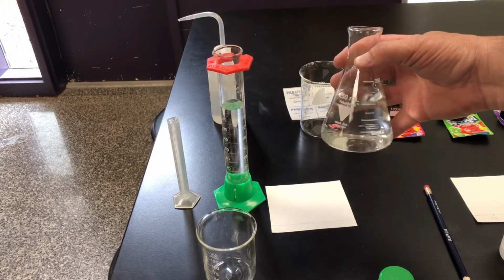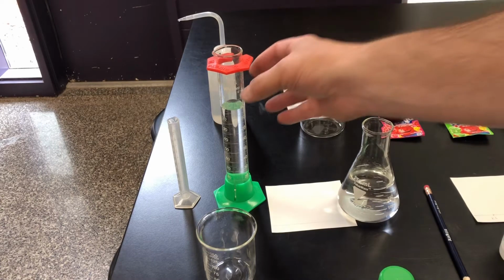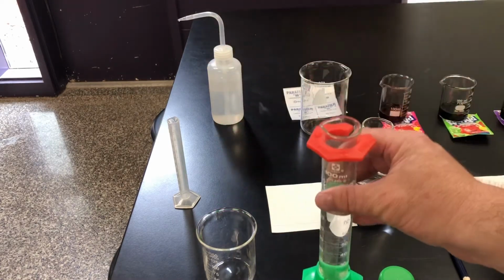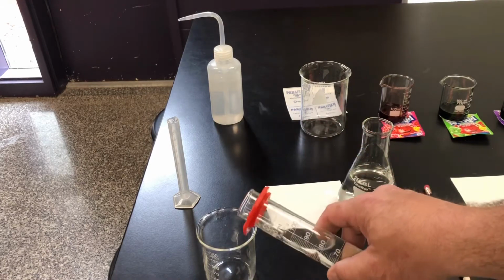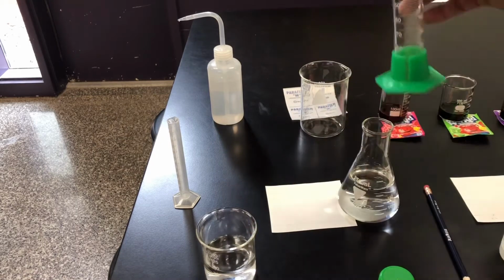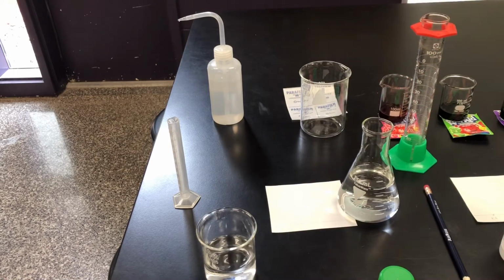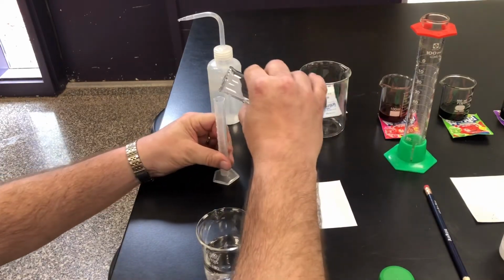So how do I get to 0.1%? It's kind of a serial dilution. For serial dilutions, we can take 90 milliliters of distilled water, and then what I would want to do is get 10 milliliters.